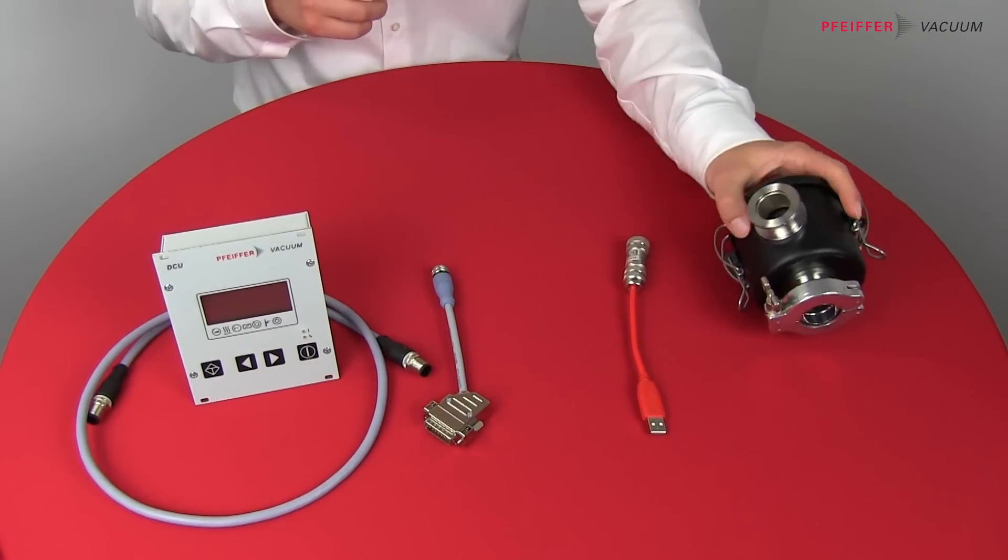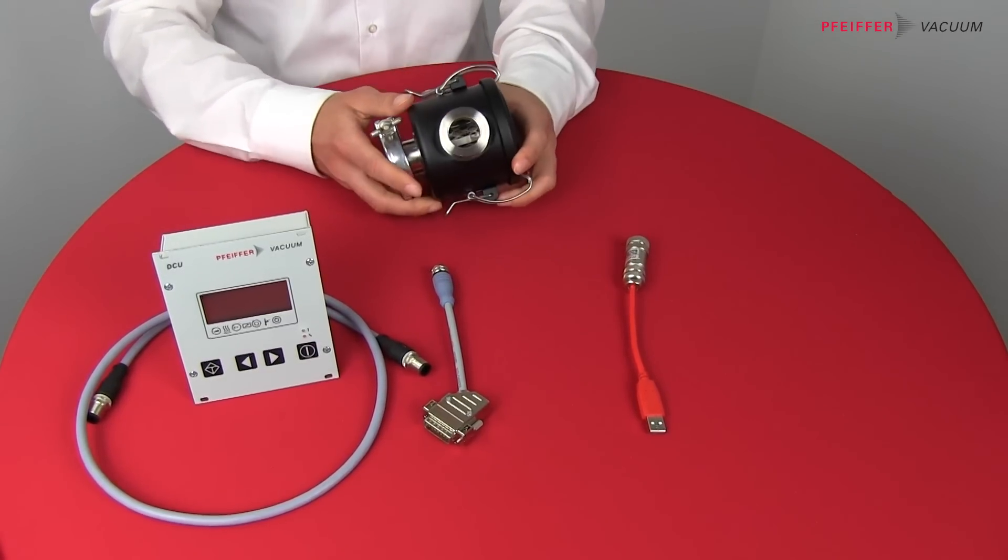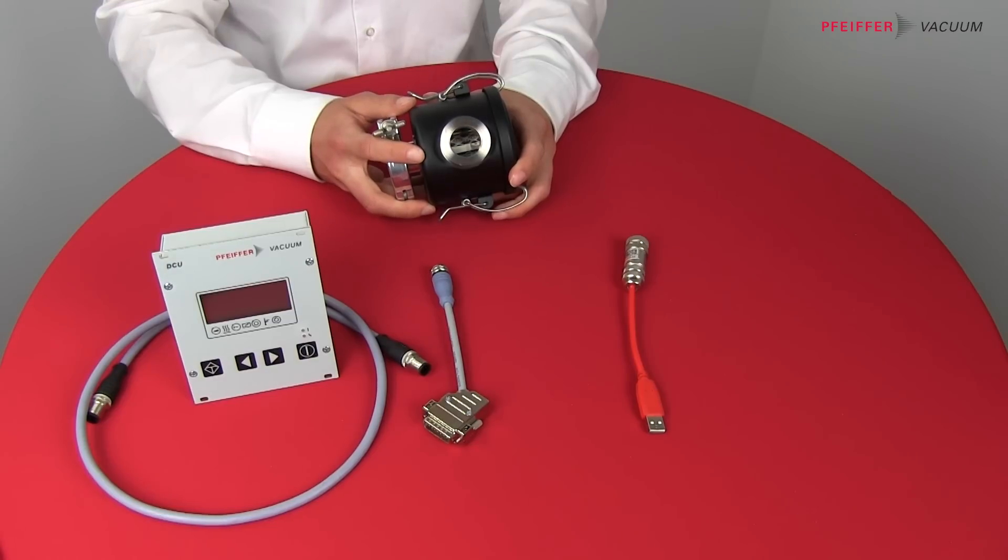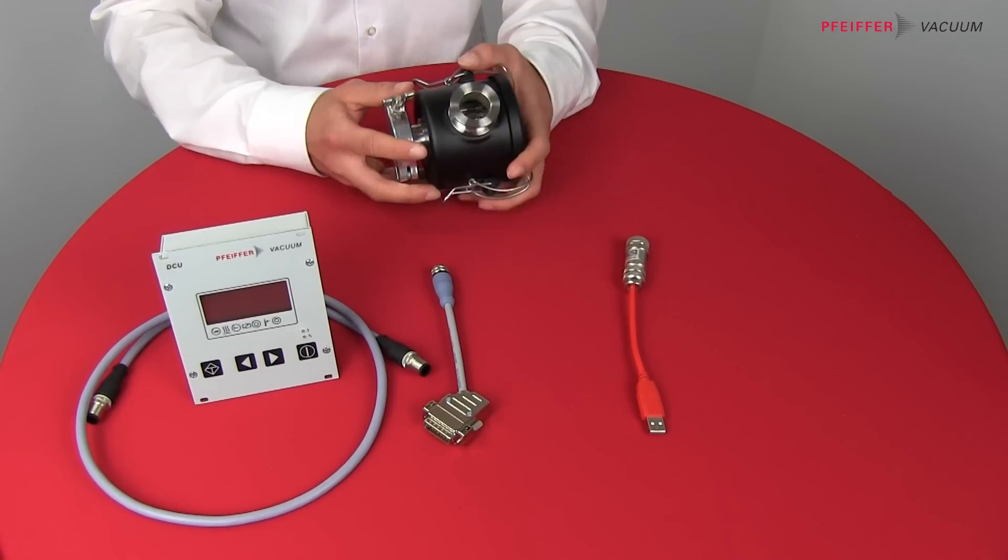Then there is a filter. This optional filter is filtering the dust created by the tip seal of the HiScroll. And it's installed at the exhaust flange of the pump.